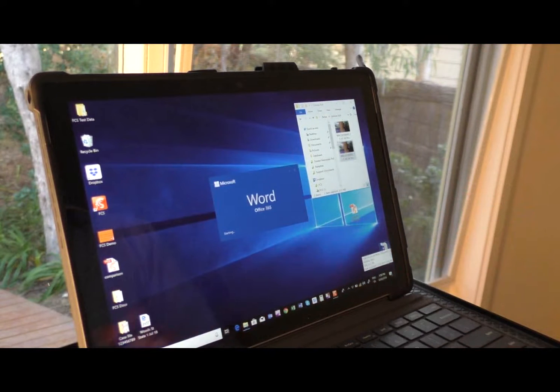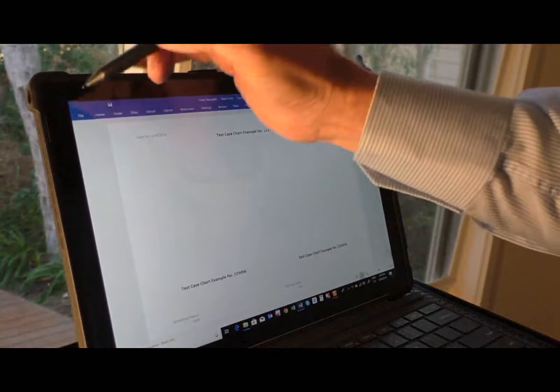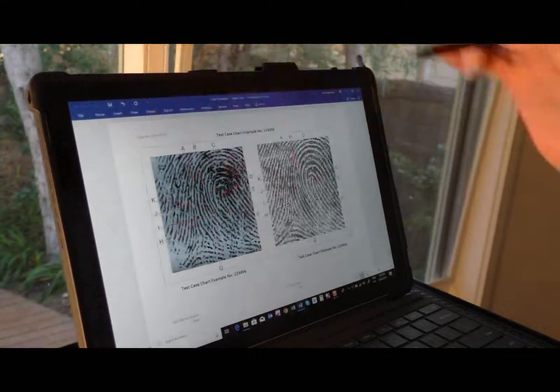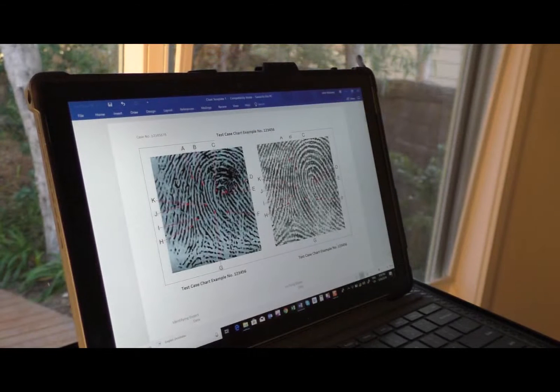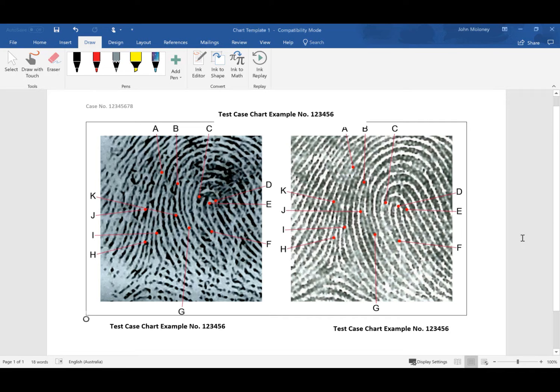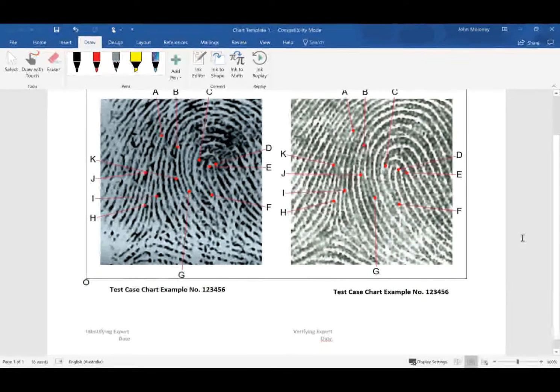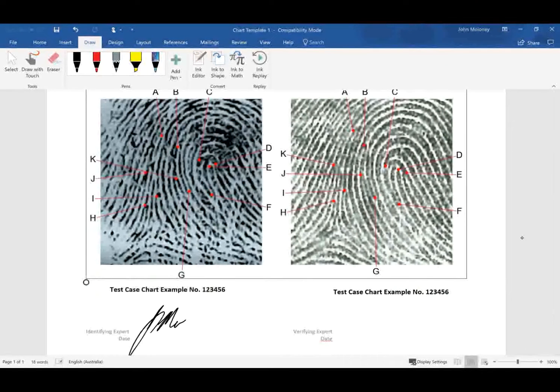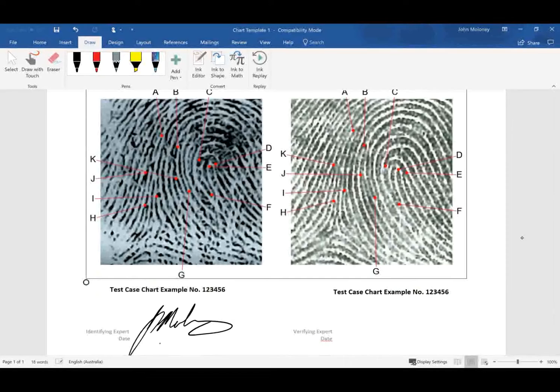The chart can then be transferred to a Word document. The chart can then be signed by the examiner and this document can then be saved to a case file.